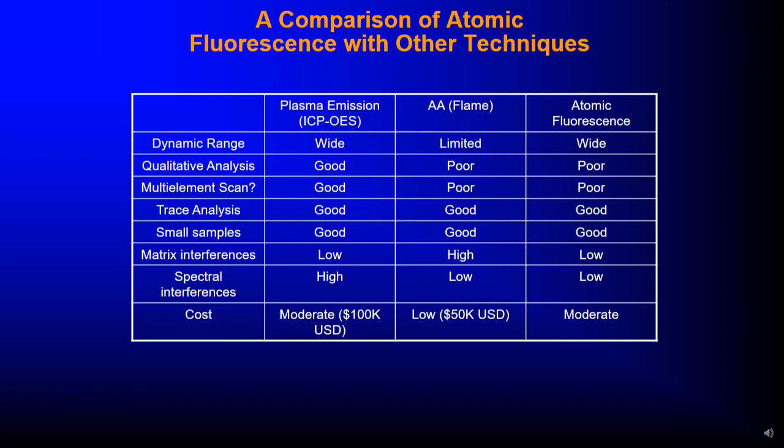Matrix interference is low in ICP-OES, very high in AAS, and low in atomic fluorescence.